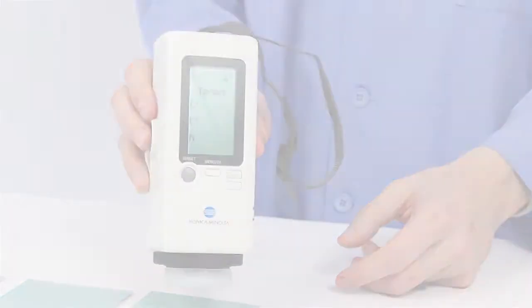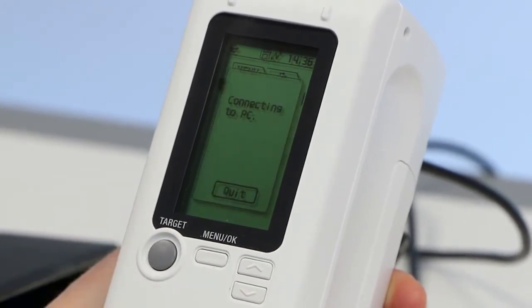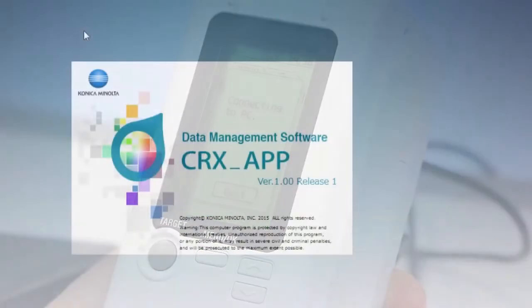To set up custom pass and fail judgments, first connect the instrument to a PC, then enter three separate tolerance settings in the included utility software.